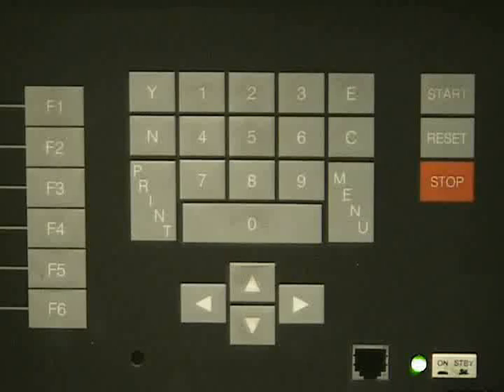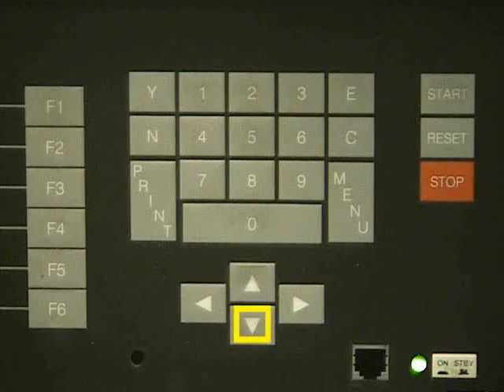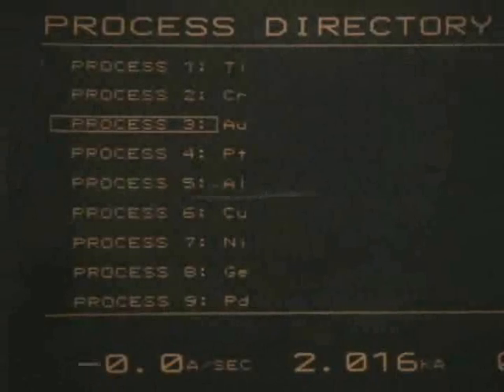The first thing we want to do is go to the program page by pressing F6, then go to the process directory by pressing F2. From this page you can select the metal you want to use. In our case we are using copper, so we will use the arrow keys to select it.